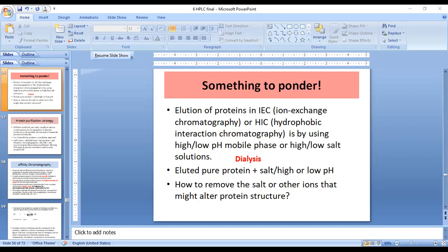So this is again a very interesting type of chromatographic technique where we do not depend upon the different physico-chemical properties of the sample molecule, like charge distribution or surface charges, hydrophobicity, size of the molecule, and so on. Here what we are interested in is the specific kind of biological interaction between certain molecules. For example, everybody knows that an enzyme reacts with its substrate in a very specific manner, or an antigen reacts with the antibody, isn't it? Then what else is there? A ligand will interact with its receptor.